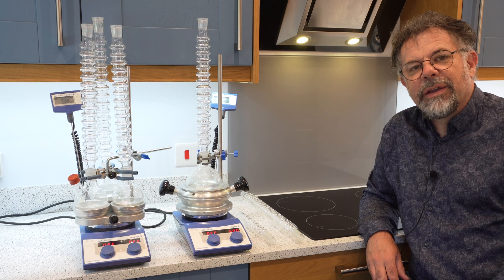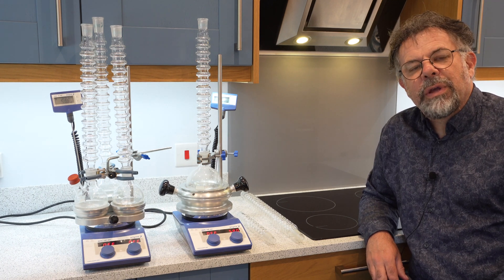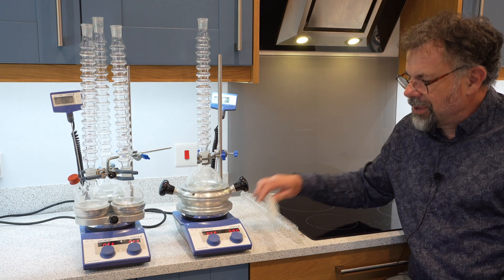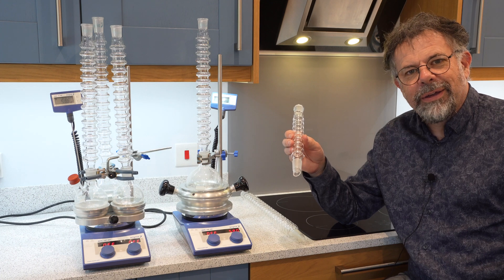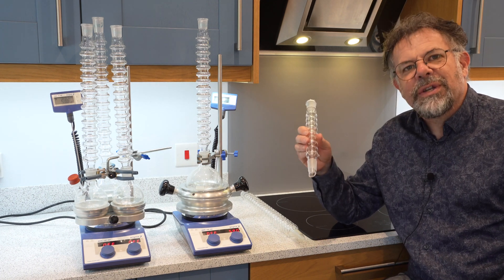If you were to break a Condensin at one of the sockets, most local glassblowers can easily repair these without having to purchase a whole new unit. Socket size is important and we carry stocks of all sizes that you require, so whatever flask socket size you have, there's a Condensin to suit.